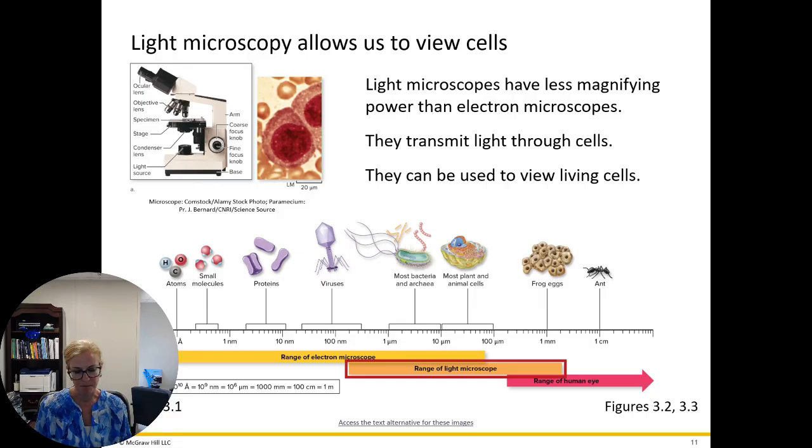So you might even use a light microscope to, let's say you want to look at a cricket up close. You might just want to look at the surface features of the cricket and see them slightly magnified. So you could use a certain type of light microscope for that. And I've looked at a lot of insects under these various different microscopes. And I have to say, it's very fascinating.